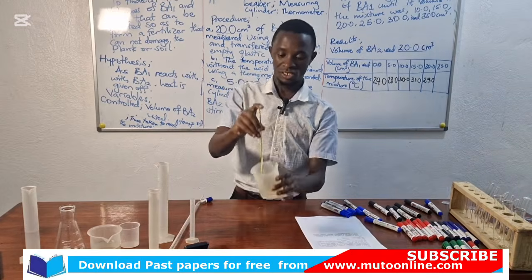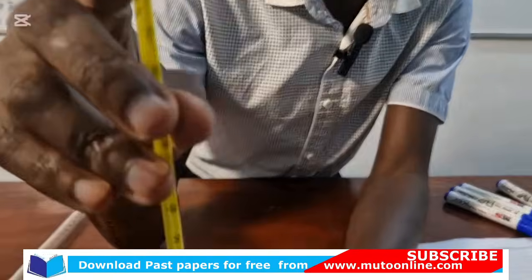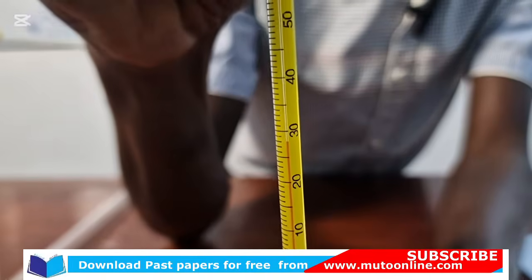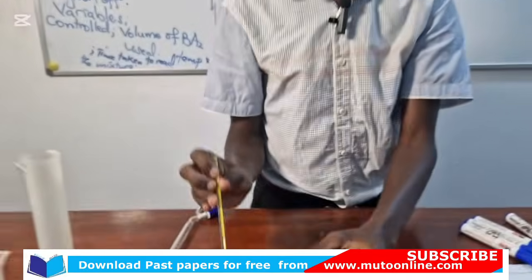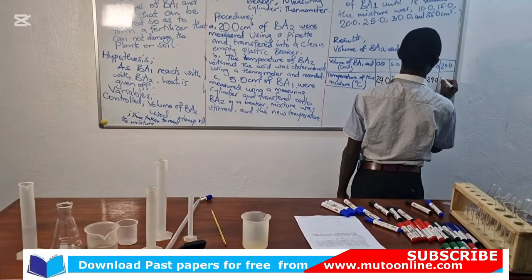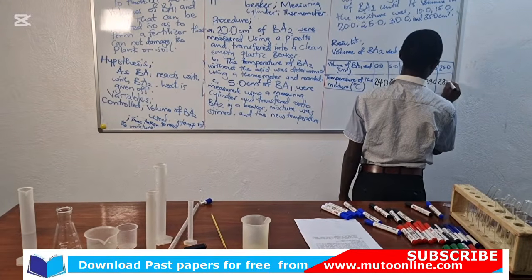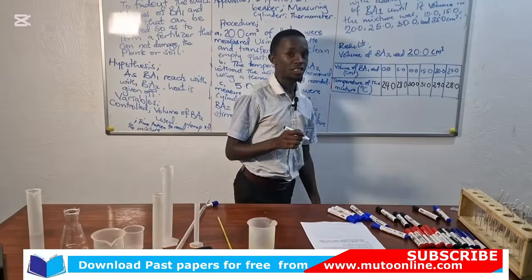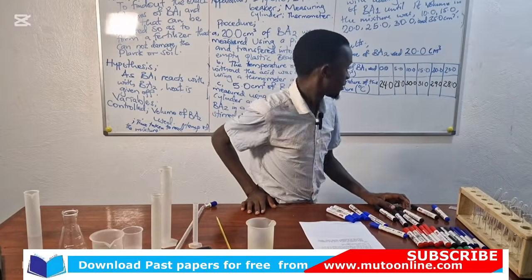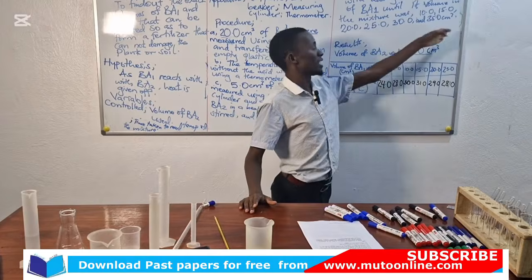My thermometer is stably stopping at 28. You can come and check. It is stably stopping at 28. So on adding 5 to make it 25, it stopped at 28. Members, I'm adding a decimal place after the decimal point because a thermometer records its values with an error. And you continue doing that for these other values when it is 30 and 35.